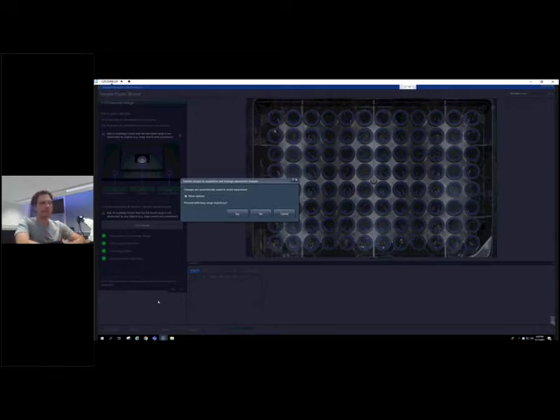in a calibrated experiment. Also here we can make use of the long-range autofocus, which is then doing a global correction of our Z-plane based on 4 different focus support points. And this will be a very good basis for our subsequent experiments.